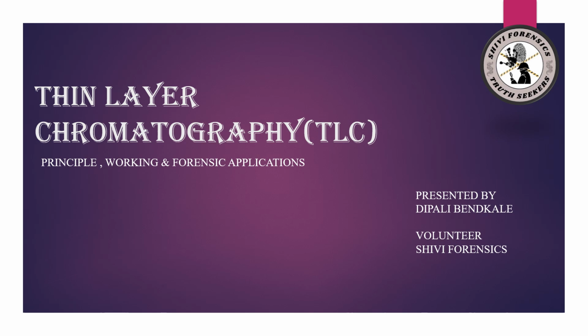Thin layer chromatography, also known as TLC. In this presentation, I will explain its principle, working process, and forensic application.